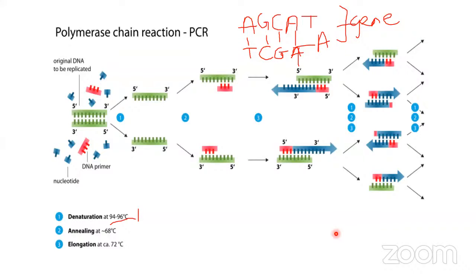How do you know the specific sequence of primer to use? Okay, so primers are predetermined. Predetermined means for you to be able to do this primer, you must have known the sequence of interest. If I work with a microorganism, number one, I can design a primer based on the sequences of my organism. If I've sequenced the organism, I can design a primer from that. Number two, I can go to an existing database and look at primers that have been used before to amplify my gene of interest. When I get the sequence of the primer, I can send it to the company that prepares primers. Then I can buy the primer.